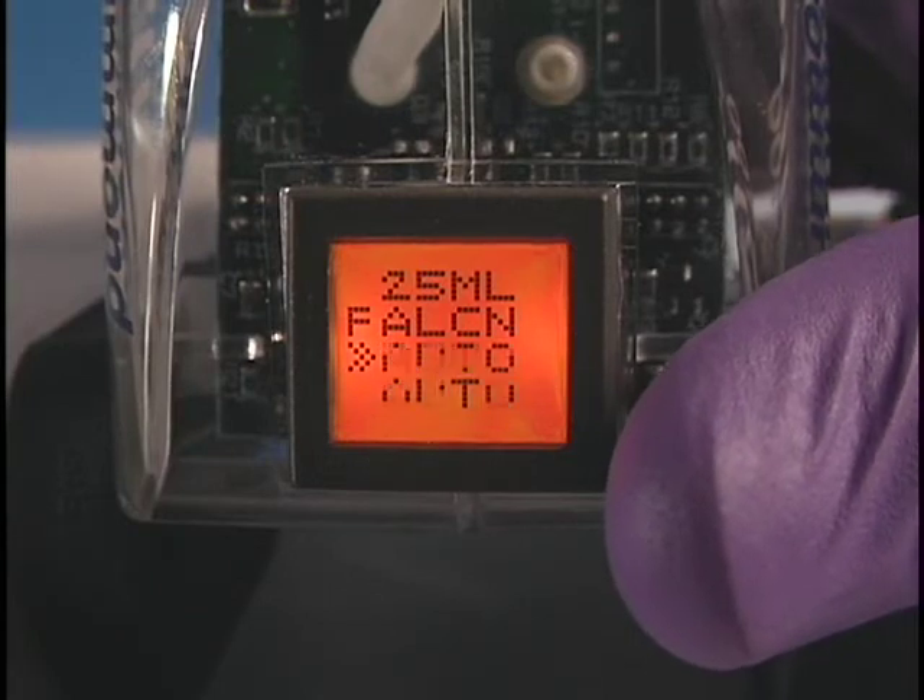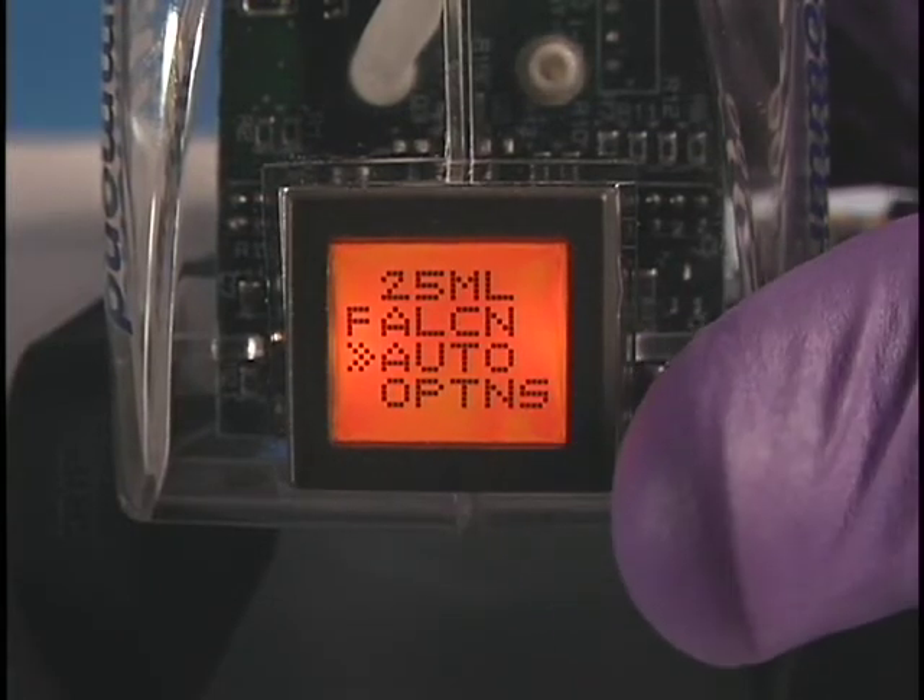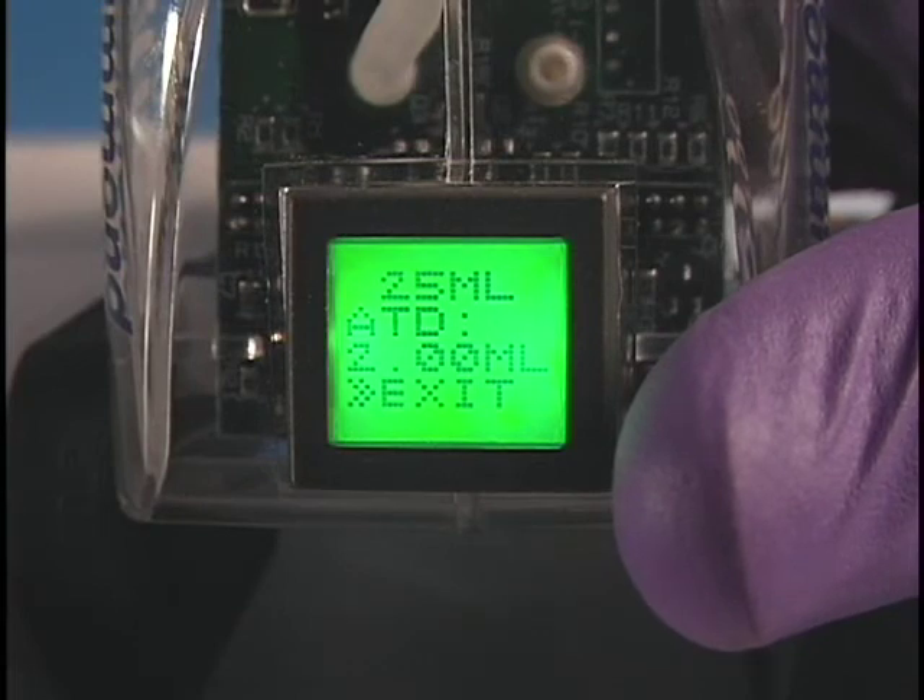Next, scroll to Auto and press the Menu button. The screen color will then turn green. You're now ready to fill the pipette and dispense 2 milliliter aliquots with unmatched accuracy.